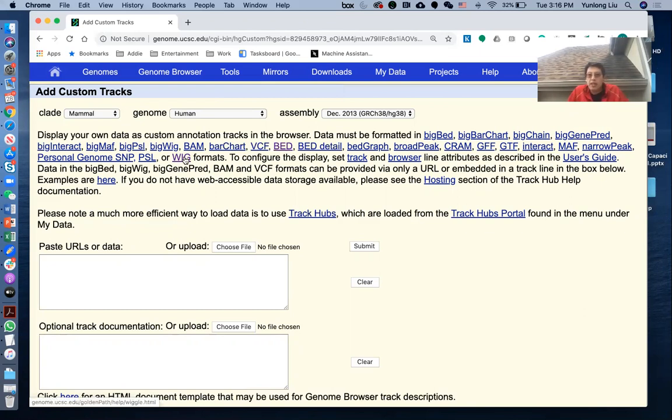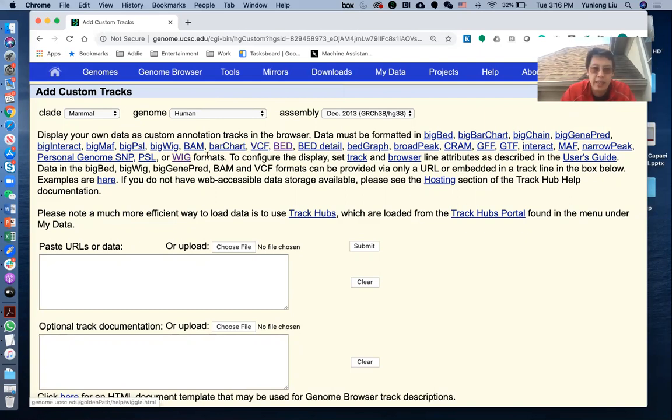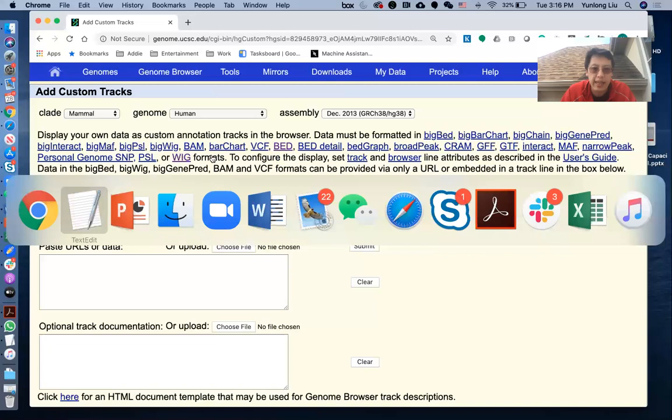So as I mentioned in the previous lecture, there are two ways to load your data into UCSC genome browser. The first one is you just directly send your data to the UCSC genome browser, and then you will be able to visualize your data. So let's see some examples of that.